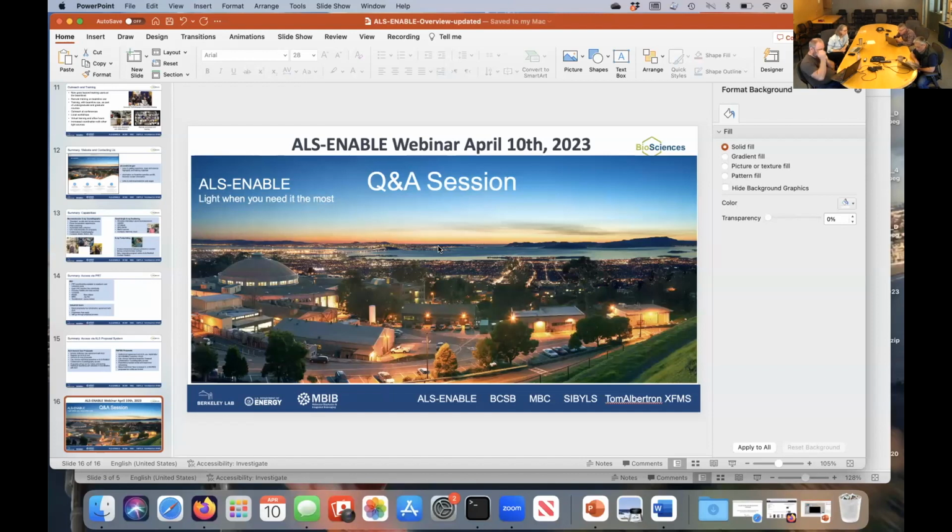Collecting data from long unit cell axes. Is there any special setup for this? You want a large detector, or you want to turn up the energy, or maybe a combination of both. You could also shift the detector up if you're pushing the detector far back in order to achieve the resolution. There's a few beamlines that do that at the ALS. Detector angle, that's right, the vertical shift. We have Q315s.